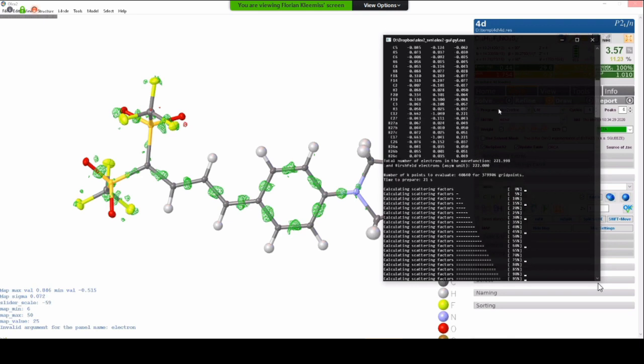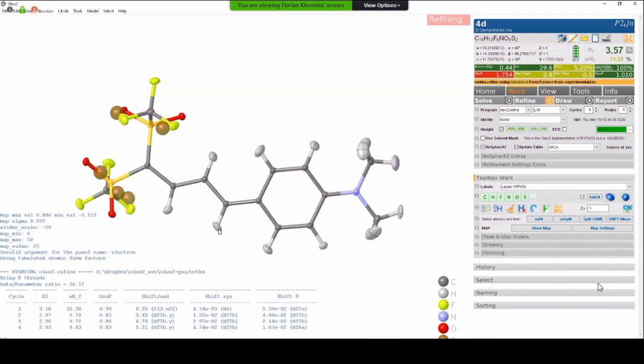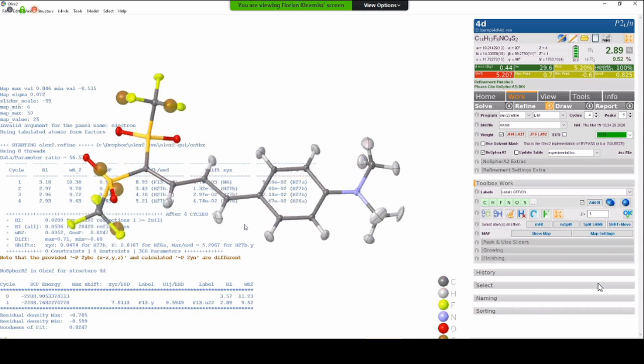So this is one step of Hirshfeld atom refinement. We have the generation of a wave function. We have the partitioning of the atoms inside this wave function. And then we have the refinement using this aspherical information. And what does it give us? You can see that Olex now switched all hydrogen atom parameters by default to be anisotropic. And in many independent atom models, this would be unreasonable.